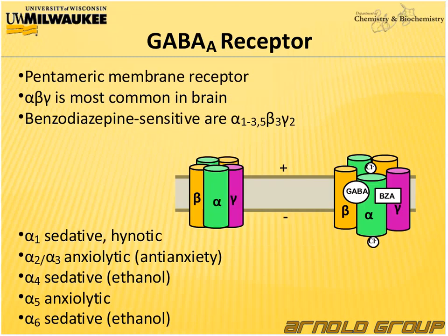The GABA receptor itself is a pentameric membrane receptor, and I just depicted that in the little figure here, where you have the closed receptor arranged in a circle, and in the presence of GABA, the receptor is opening and increases the chloride flux into the cell and increases the negative potential. Although there are 19 gene products known of the subtypes of the GABA receptor, the most common one is the alpha-beta-gamma combination in the brain.